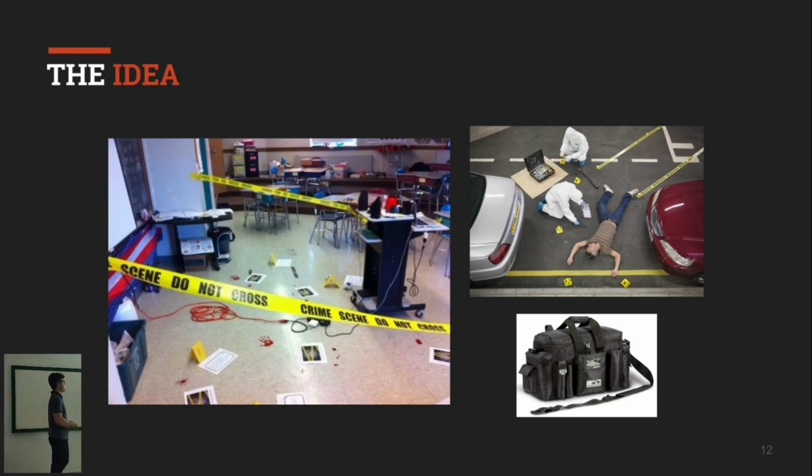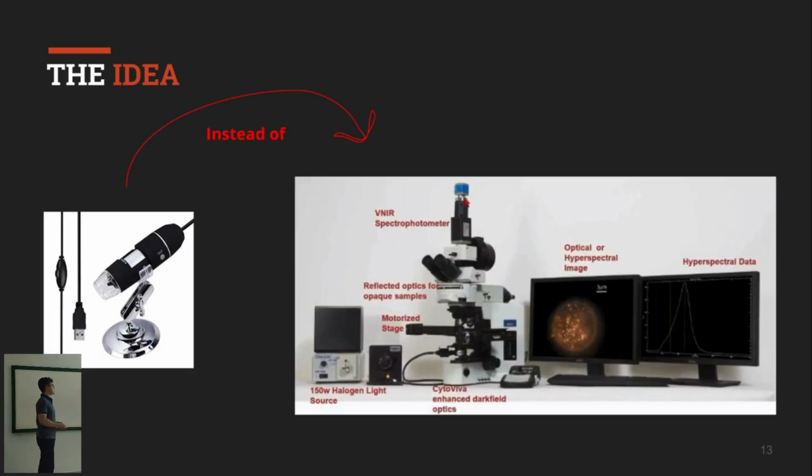Okay? So I want a portable microscope instead of this huge equipment to see hyperspectral imaging from pollen grain samples.